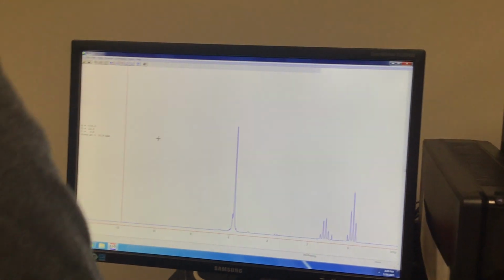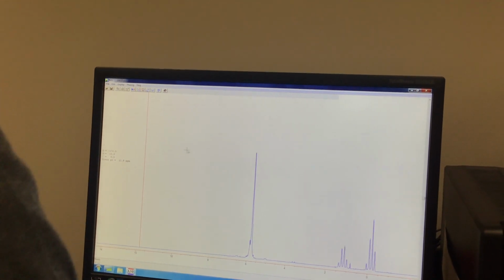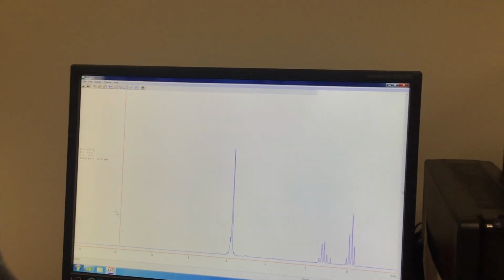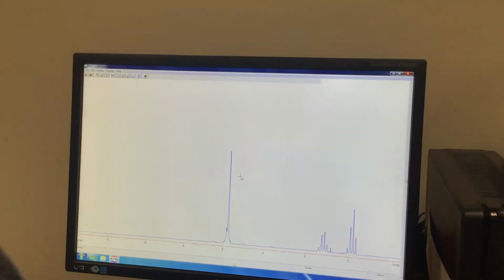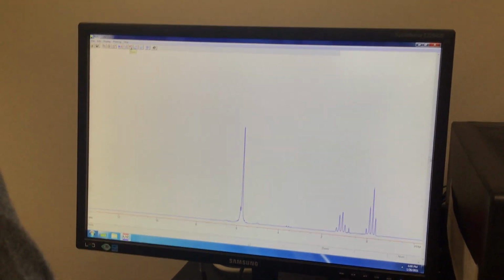If you do the zoom function and then just circle over everything, like don't actually zoom into anything, like select the whole screen, it'll let you out. There you go. See, sometimes it lets you do that normally, but it doesn't.